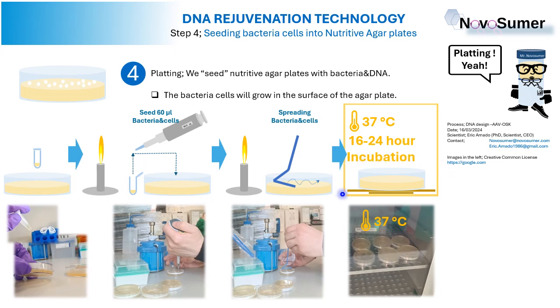We don't require agitation for this purpose. The only thing that we need is this chamber being able to hold a steady temperature of 37 Celsius degrees. That's all that we need.